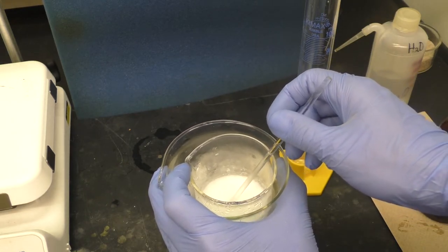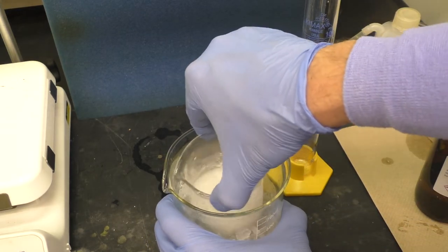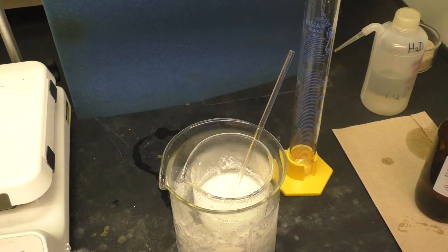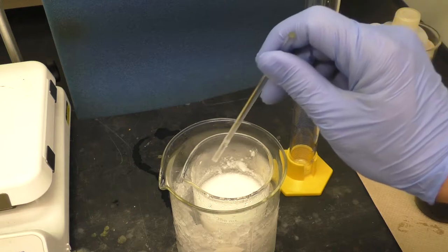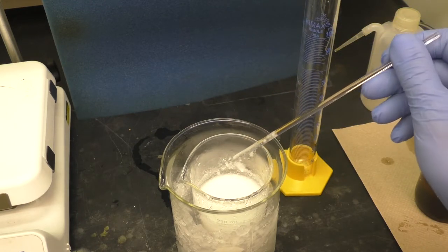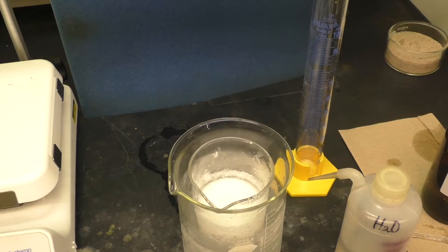So at this point, I'm just gonna leave it sitting buried in the ice bath, and let that sit until it's fully chilled and all of the material has had a chance to either precipitate out, as you see with this kind of white material, or crystallize if there's any remaining in solution. So we'll let that fully chill, and then from there we'll isolate the solid product. We've let that chill for a little while.